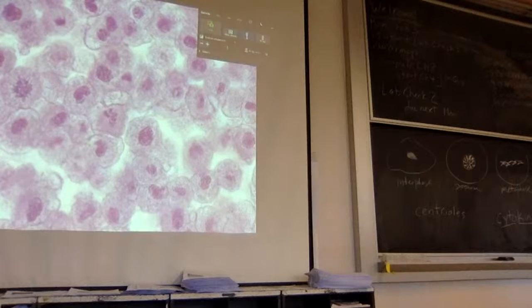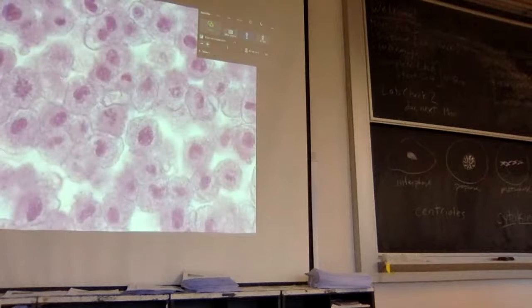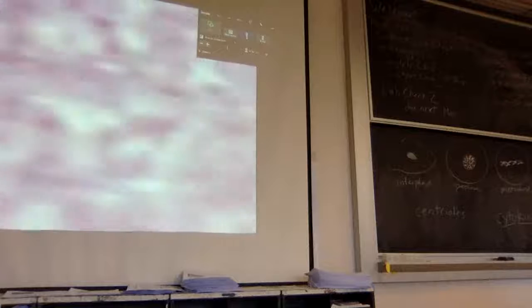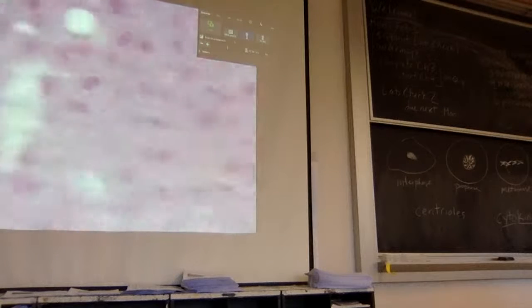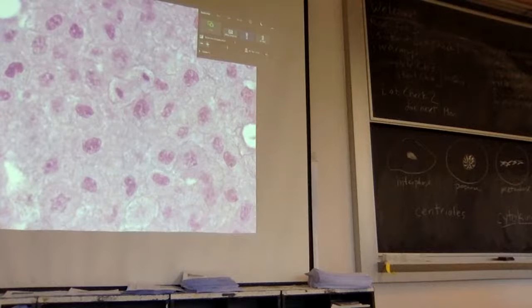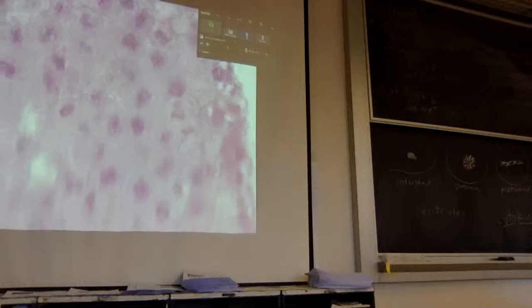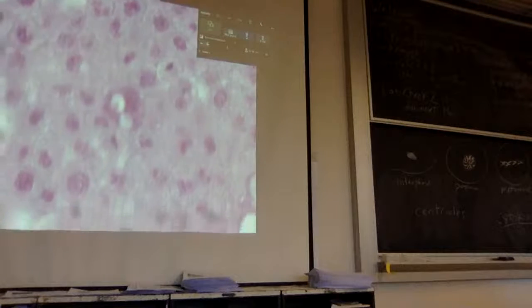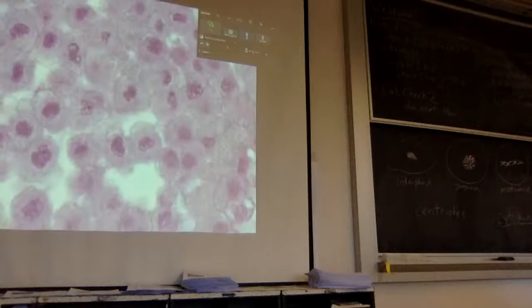That one looks like it's in prophase. This one here looks like prophase. This one over here looks like it's in prophase. Oh, here's another. Yeah, I'd say this is telophase also. So they're pretty far apart. So this is telophase.